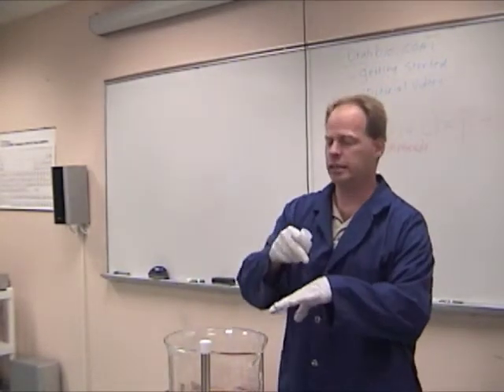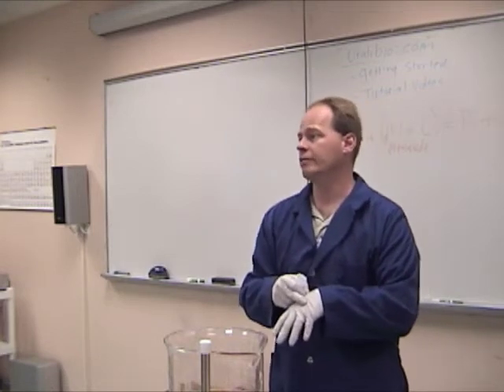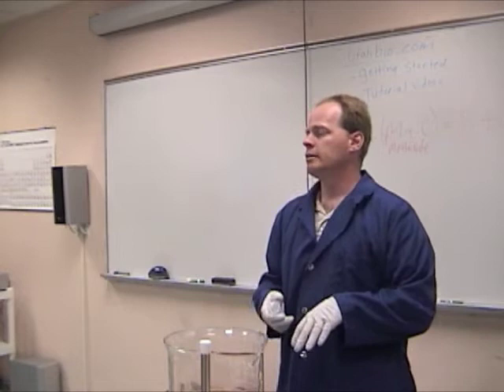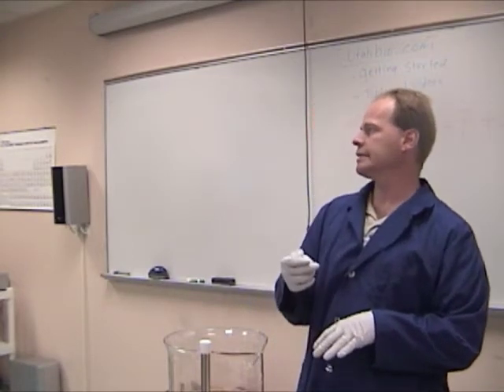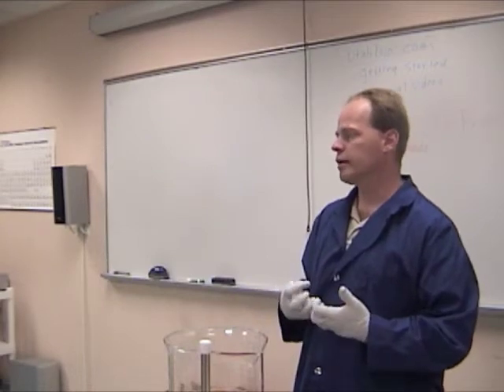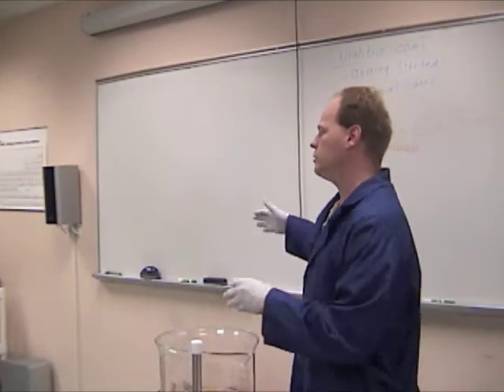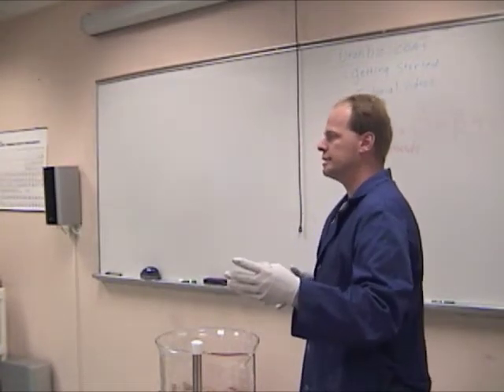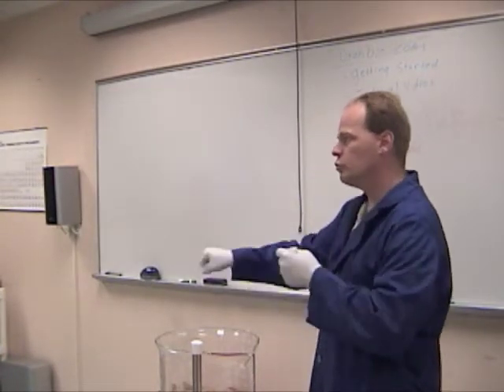If I put some of this on my hand, it begins to burn. I can feel it almost immediately. That means I can wash it off. Potassium methylate and sodium methylate instantly kill your nerves. You don't even know it's hurting you. It's an incredibly dangerous product to use unless you have the ability to transfer it from the container it's in directly into your processor with no intervention of you moving hoses around.